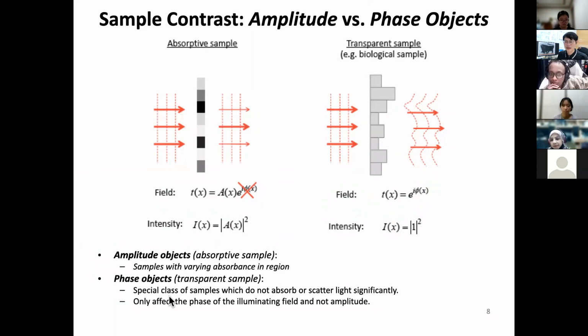But here I want to make sure that we understand standard detectors such as the CCD camera and CMOS camera you are using in the laboratory. They are only seeing the intensity. They will not be able to see phase directly. That's what you have to understand. Then how can I understand the information of the phase?